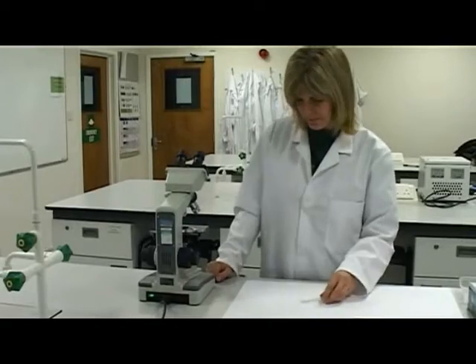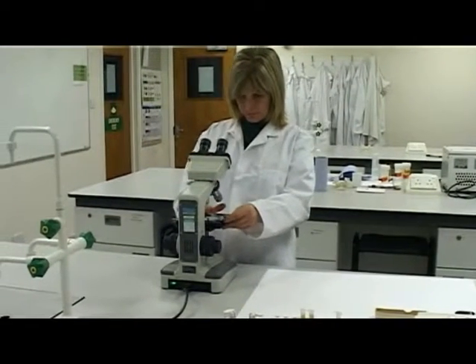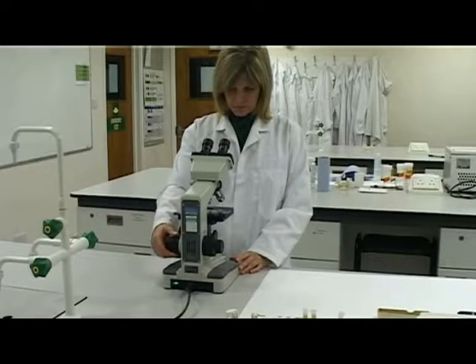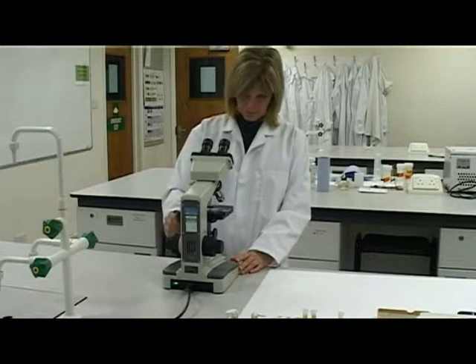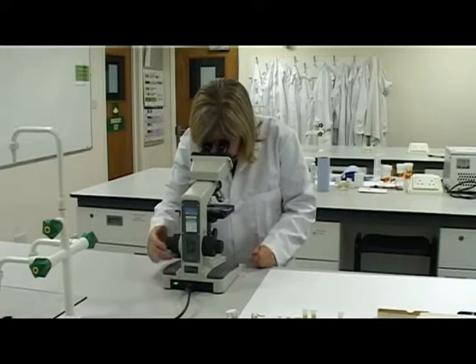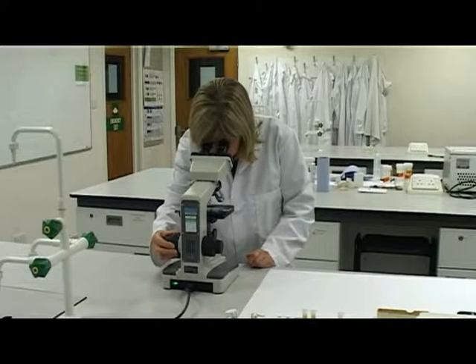Place the microscope slide on the stage the correct way up. Look at the stage directly whilst racking it up so that it is positioned just below the objective lens. Look down the eyepieces. Adjust the coarse focus to focus the microscope, then adjust the fine focus.